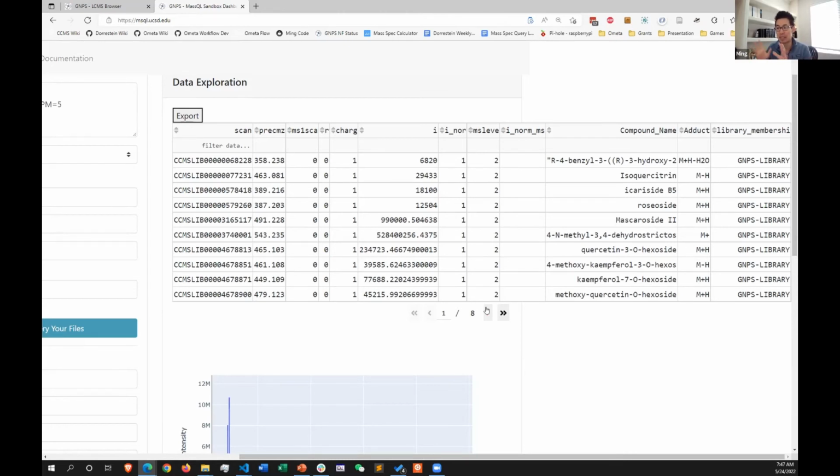You can pick any subset, even if we can't identify any chemical subset, that you can express as a pattern, pull that out, take a microscope to that bigger data, and look at that full chemical diversity. That wasn't possible before, but now these tools give you that kind of capability. There are a couple of workflows behind the scenes that you'll actually have to run. But anyway, that's the pitch for why this is kind of cool.